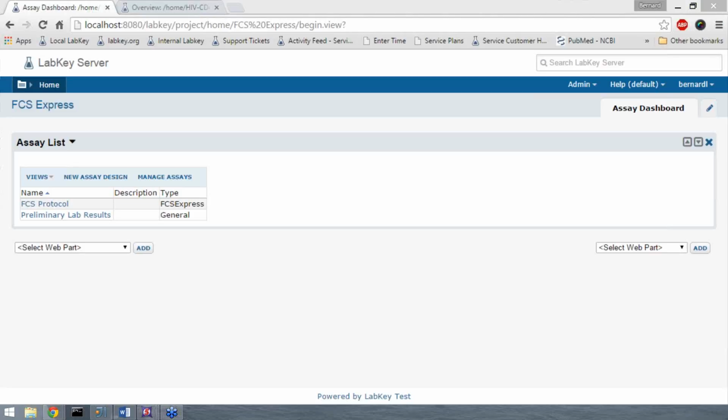Hello, everyone. As Kaya said, my name is Bernie Lee. I'm a program manager for LabKey Software. And today, I would like to briefly walk you through some of the features that Kaya described about LabKey.